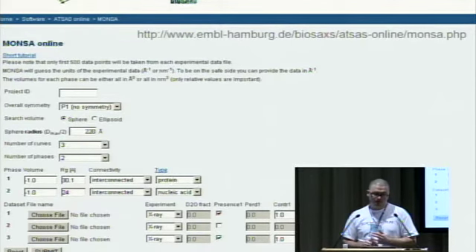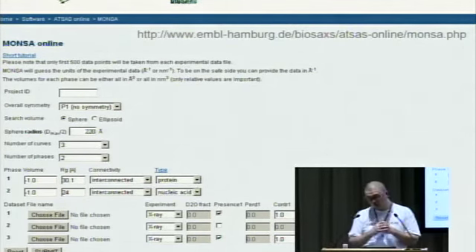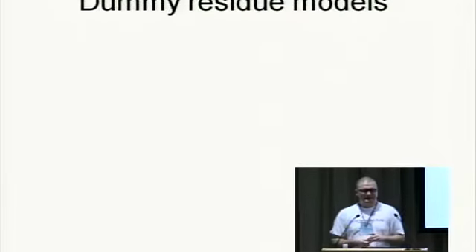And neutron scattering would be applicable if you have a protein-protein complex or protein-nucleic acid complex, but you do know that the shape or the conformation of the protein changes upon complex formation. So using neutron scattering, one could hide a part of the complex from the neutrons and make only the other part visible.